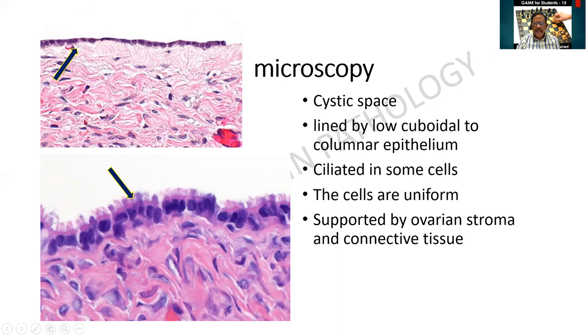And this is the ovary. The ovary is generally identified by means of a wavy stroma. The cells are all not straight, the nuclei are straight. And look at this one. I find a kind of waviness, and that is a catching point for saying that it is an ovary.